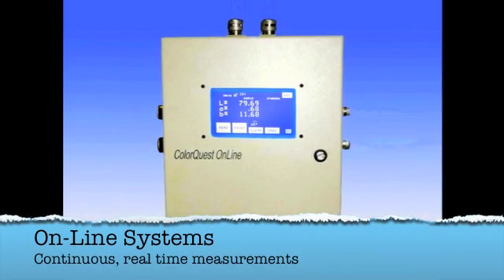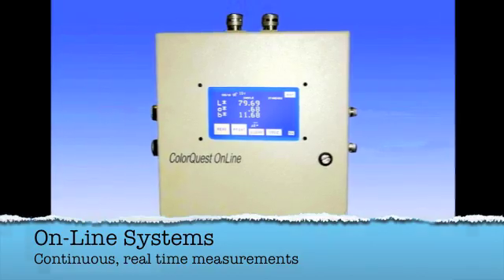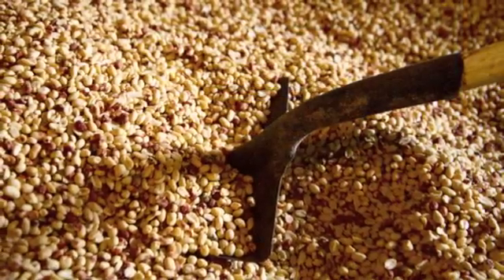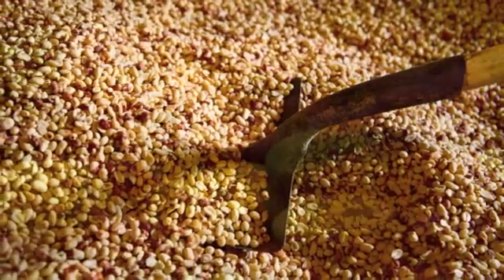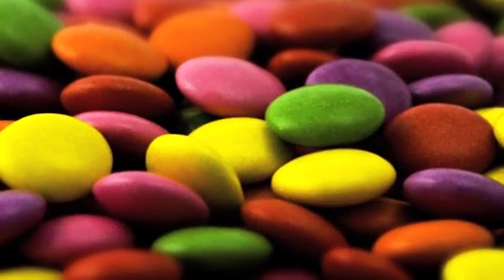Lastly are our online systems, which are able to provide continuous real-time measurements of your products. They are often found on the processing lines for 24-7 inspection, which allows you to respond to product color changes when they happen.